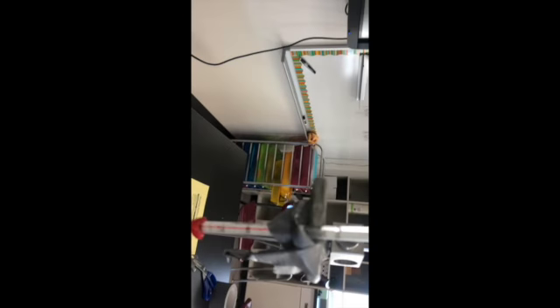All right, our last 5 minutes here. It's probably almost been longer than I doubled it. And you can see here that we got condensation on our thermometer. You would think that the temperature would continue to rise and go hotter and hotter, but yet it still only sits at 98 degrees Celsius.